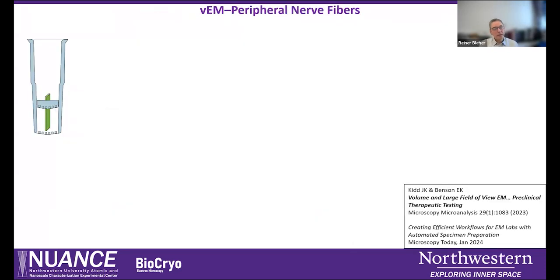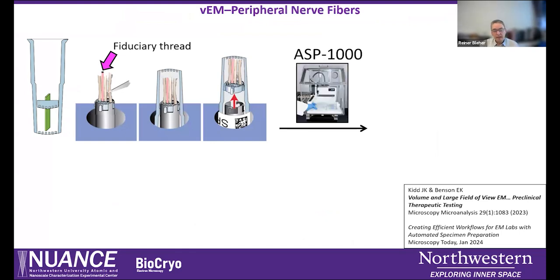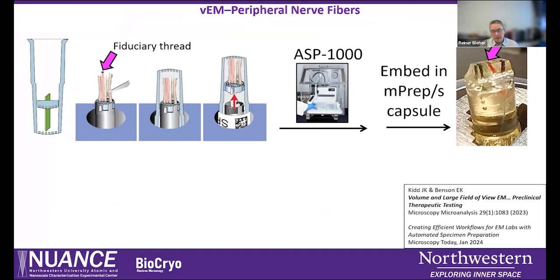So, and there's also this case where we can use this clamping mechanism for the capsules, for sample capsules. And we can also, for example, include fiduciary markers that allow us better to estimate the position where we are with sectioning. This has been done here. And here, again, the whole capsule is polymerized, and we can see nicely our marker.